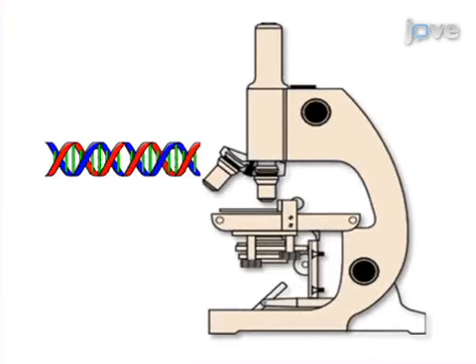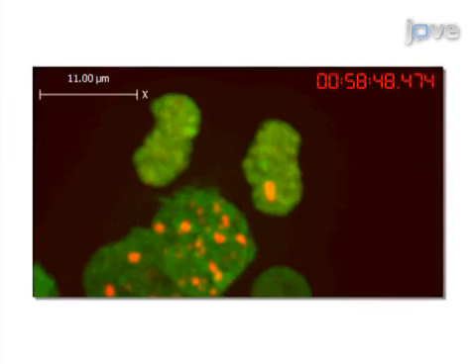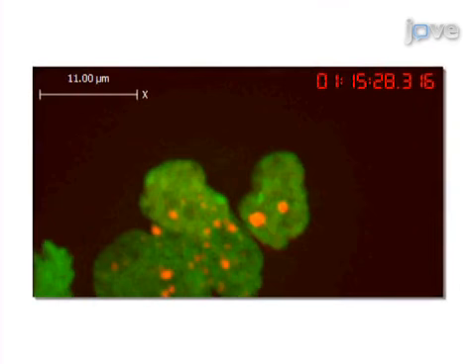Ultimately, live cell fluorescence microscopy can detail cellular dynamics, like the formation of 53BP1 foci in response to DNA-damaging agents, or 53BP1's behavior during mitosis. We first became interested in 2 and 3D live cell imaging when we wanted to study how varying treatments affected mitosis in certain cell lines.